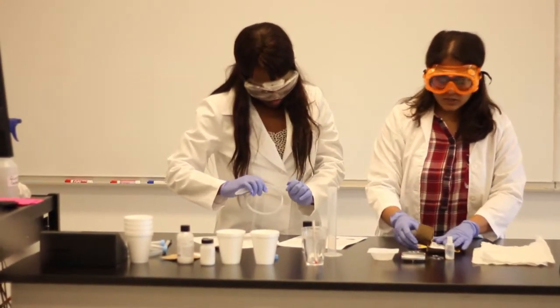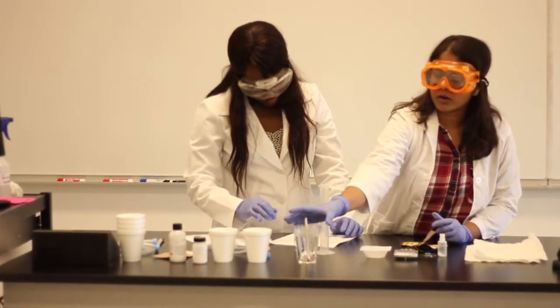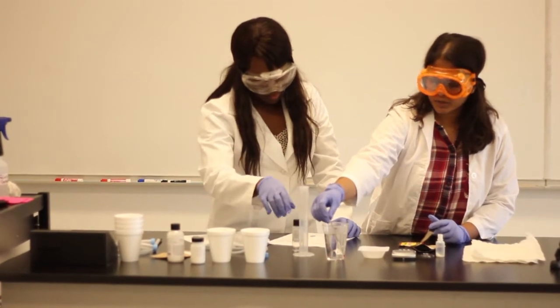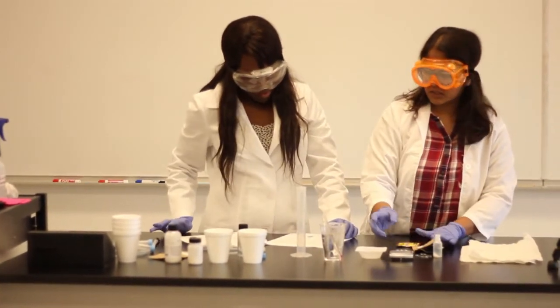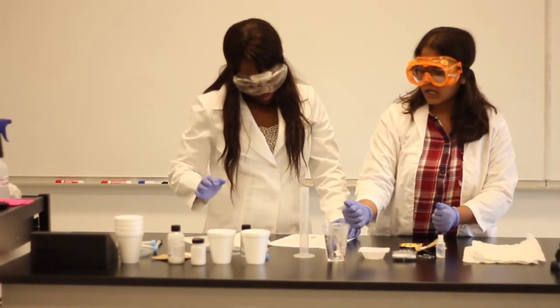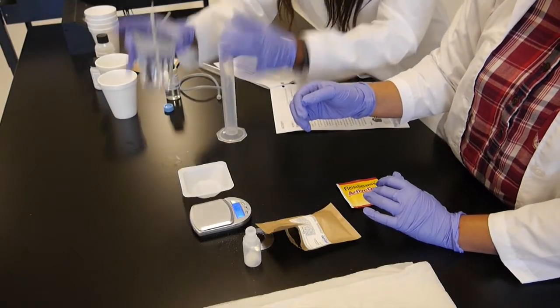Now we need yeast solution to be added to this sucrose. So we need hot water at least at 35 degrees Celsius temperature. We have here water around 35 degrees Celsius temperature. Now we need 125 ml of it in a beaker. Okay. Let's measure this out.